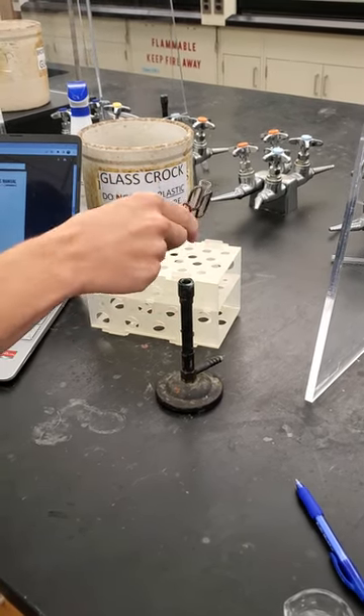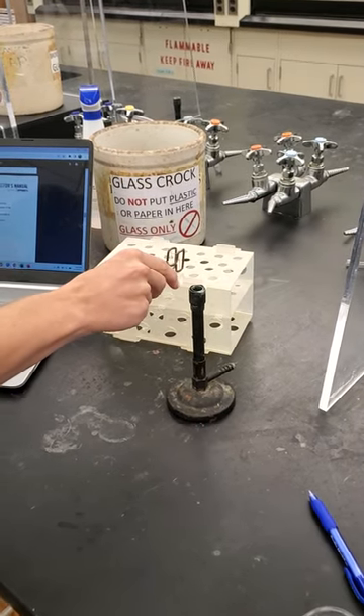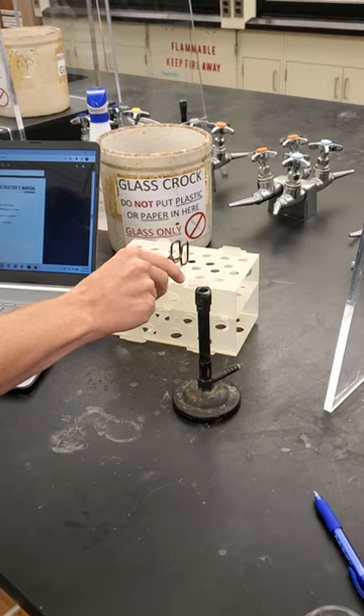Once you're done heating it up, you put it in its little thingy. And you're good.